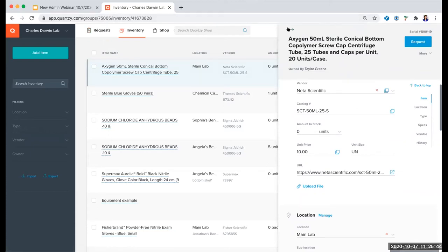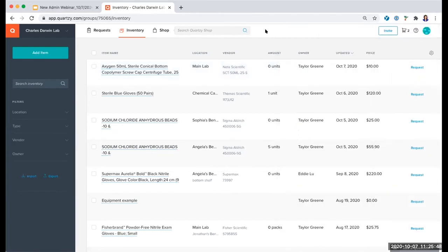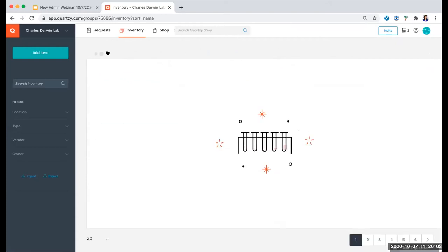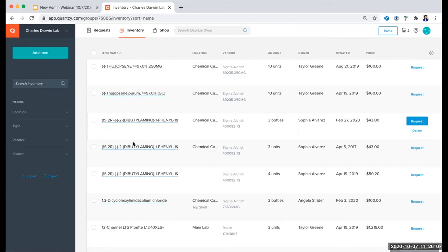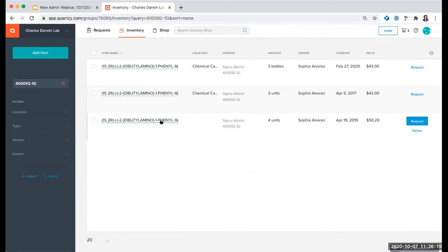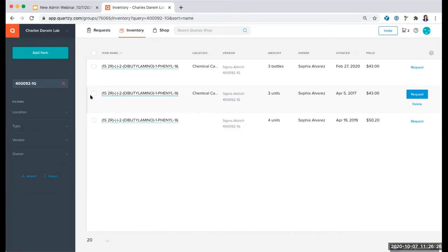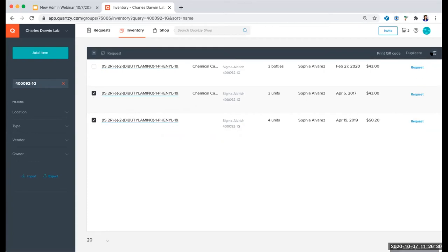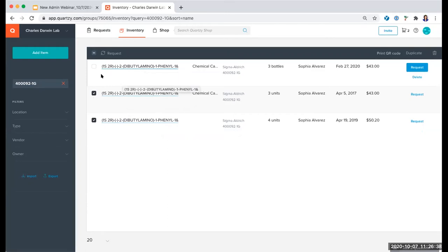A question came in: can you merge duplicate chemicals or materials in the inventory? We don't have a specific way to merge. What I would recommend is a couple of different approaches — you might just sort by the item name, which is a great way to surface any duplicates that have the exact same name. Similarly, if you copy a catalog number and search for it, this would also show if you have any duplicate items. Then you might delete the duplicate items and update the quantity for just the one item you want to keep in the inventory.